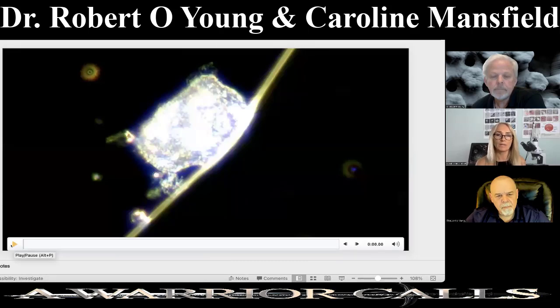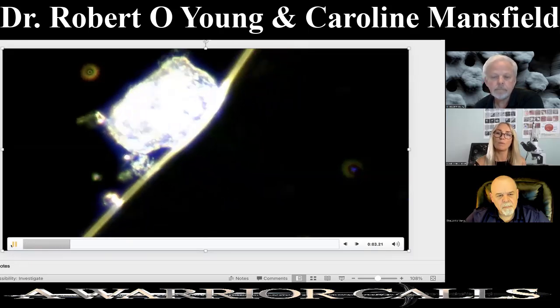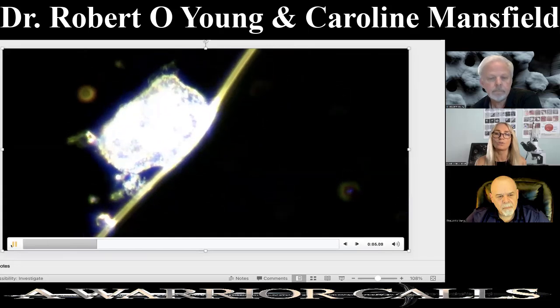Darkfield microscopy, it refracts the light. We have a dark background and particles show up bright. And especially with zeolites, it's a very bright crystal under the microscope. So this is just one of the crystals caught next to an air bubble that's sort of propelling it along.